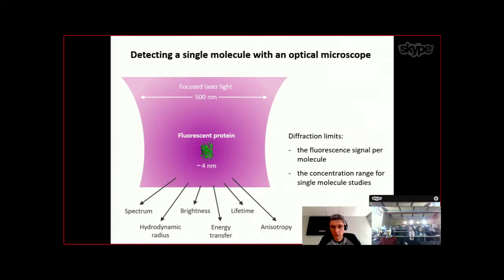A cell is a crowded environment by definition. And here, you are working in an environment that is a thousandfold more dilute. So that, of course, is going to affect how your protein sets its conformation. It's also going to affect, of course, the interaction dynamics with other molecules.